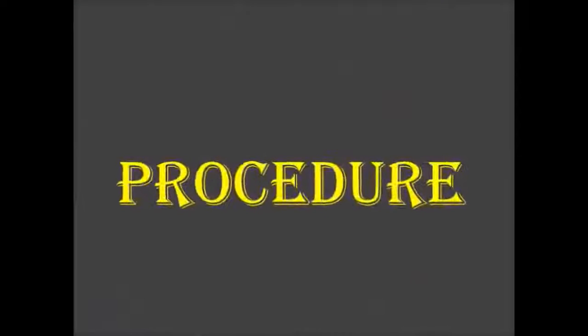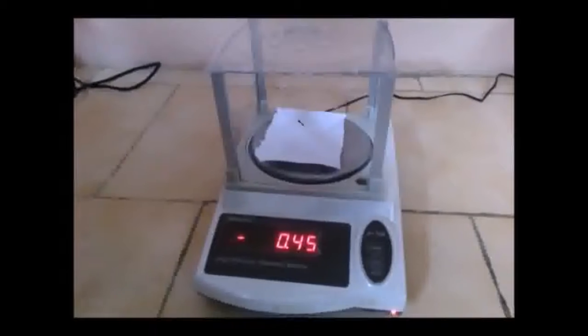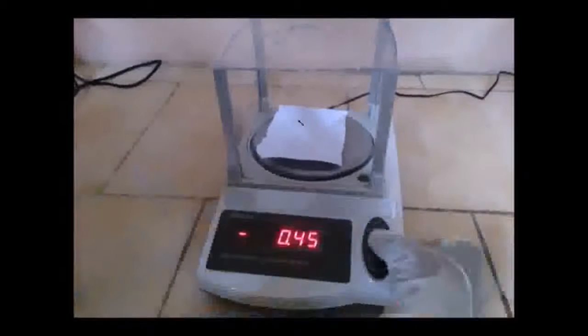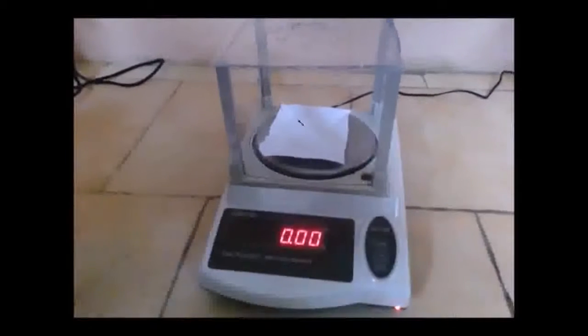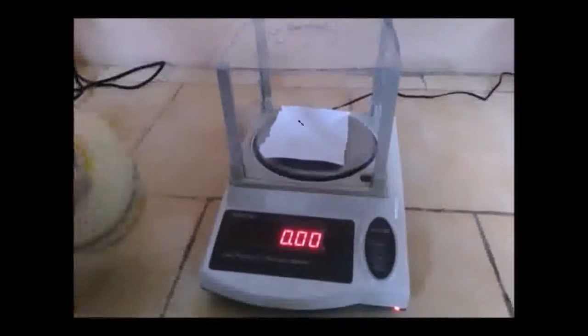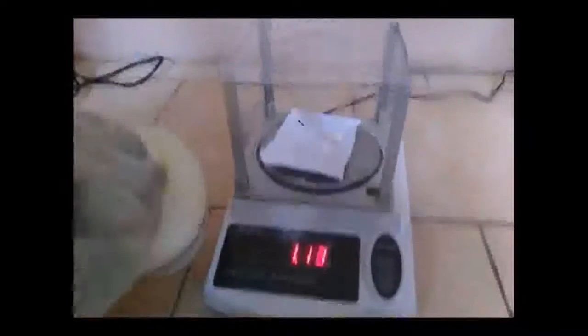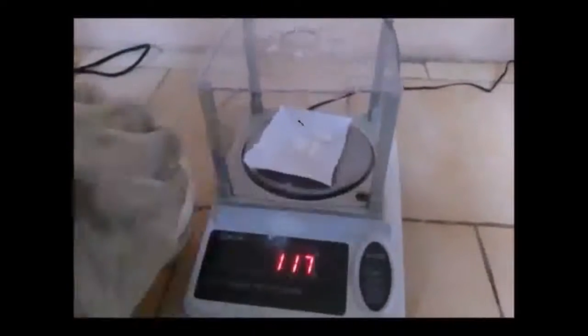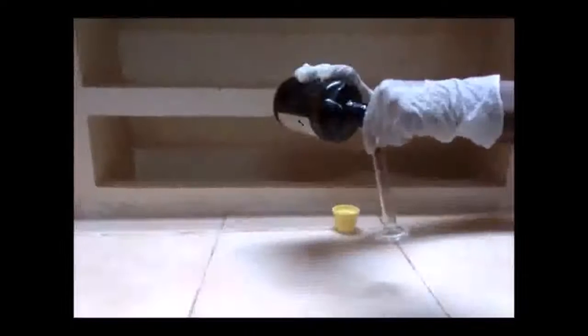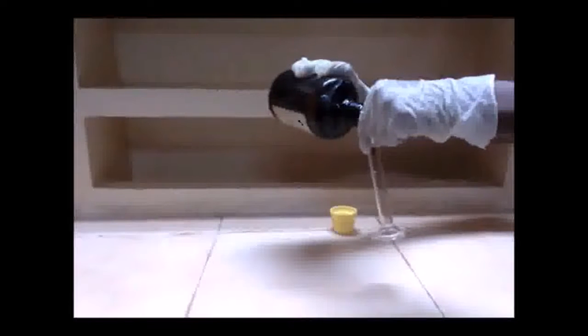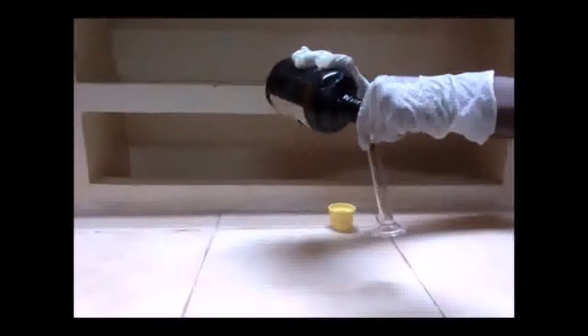Synthesis of Aspirin starts with zeroing the weighing balance. Weigh 2g of salicylic acid on a tared weighing balance. Now measure 4ml of acetic anhydride.